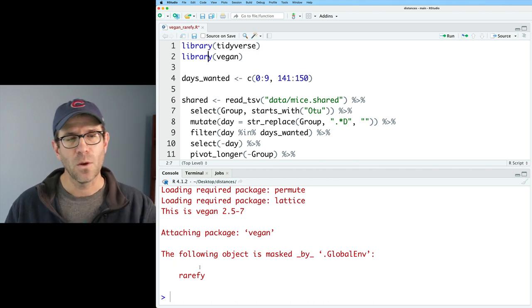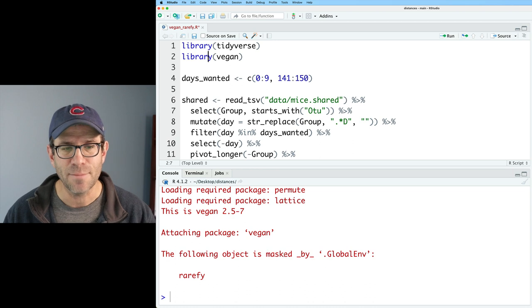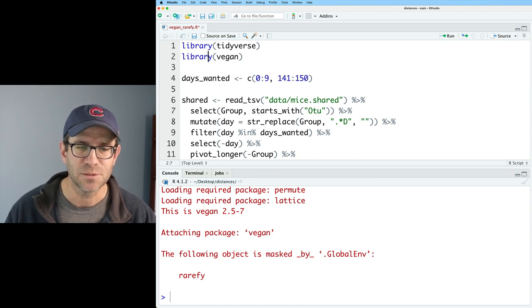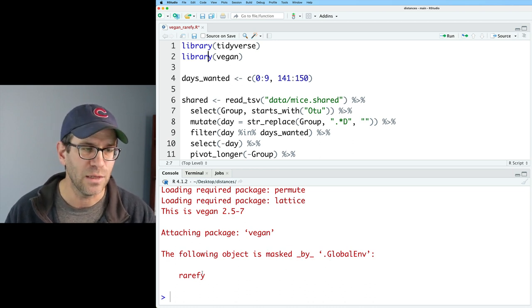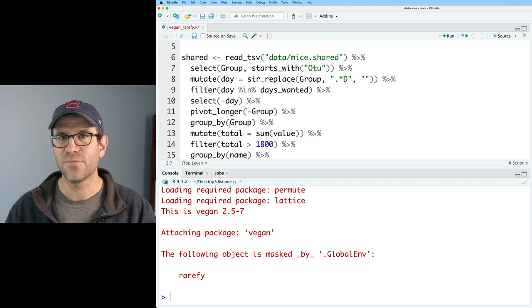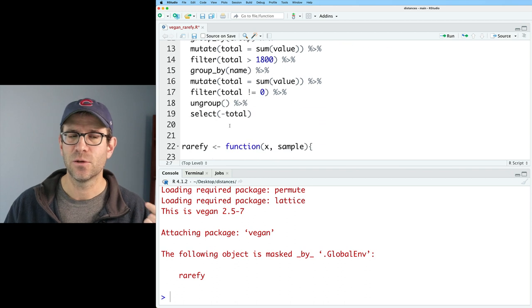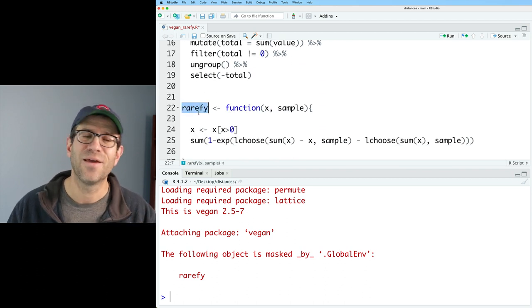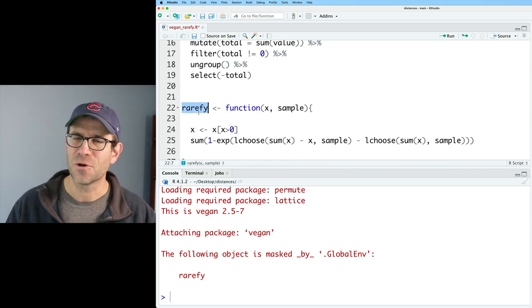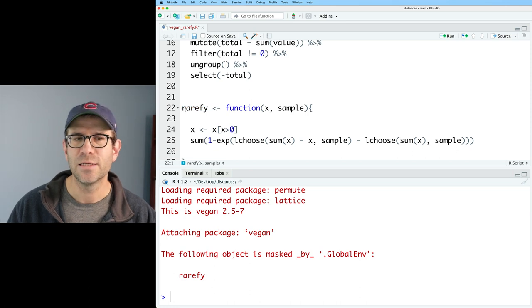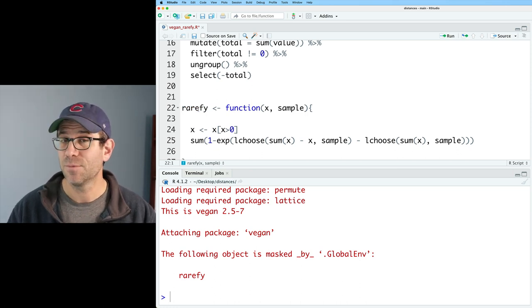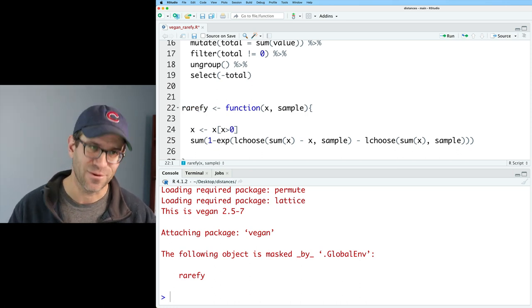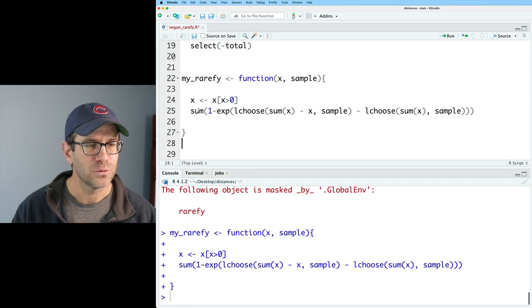Now, one of the things that we see when we do this is that the following object is masked by .globalenv because vegan has a function called rarefy and I have a function called rarefy. So what I'm going to do is I'm going to rename rarefy to be my_rarefy. So we'll do that.